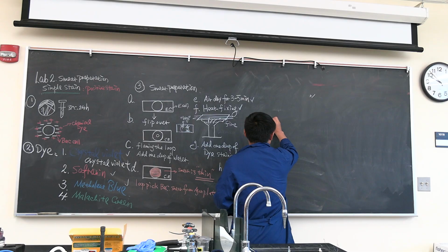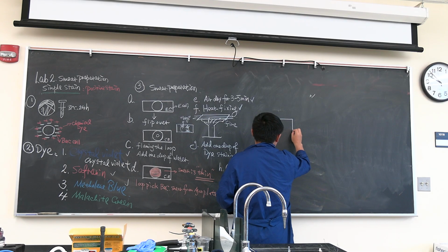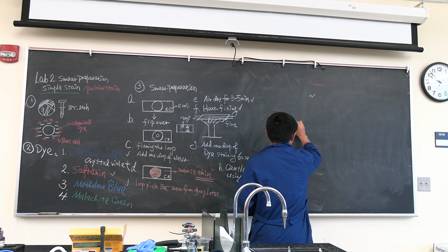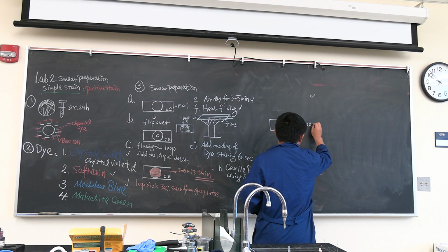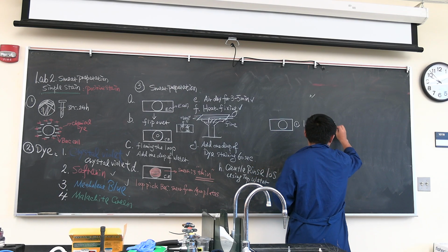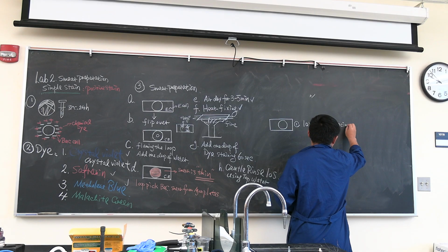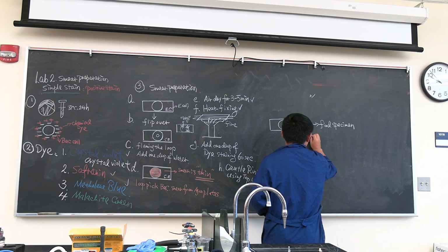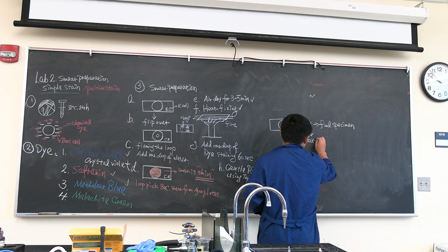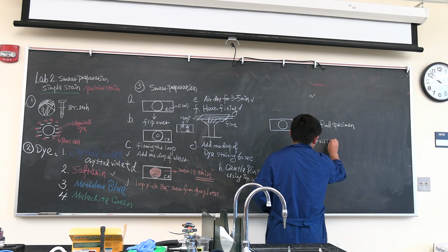Then this glass slide is finished. We will use 10x to find the specimen, and then we move to 100x with oil immersion.